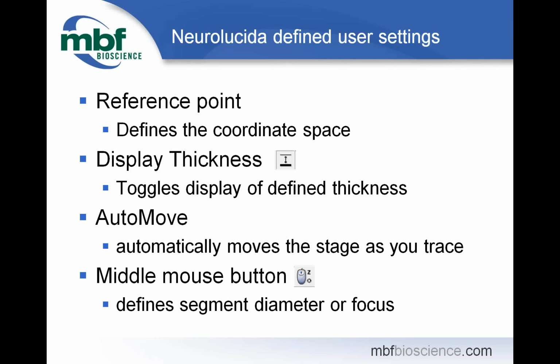So if you're having trouble getting Neurolucida to do what you want when you first open the program, it may be because you haven't placed a reference point yet.